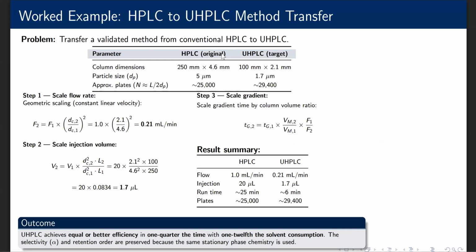Let's try our next worked example, the third. So in this one, we're trying to transfer a method that we have in HPLC to UHPLC. Try this out on your own.